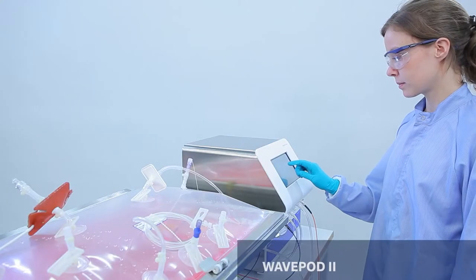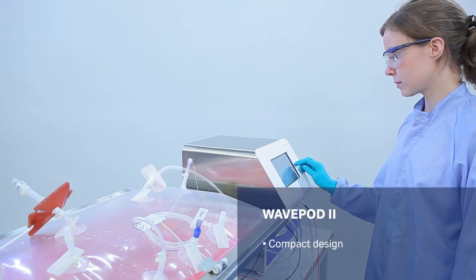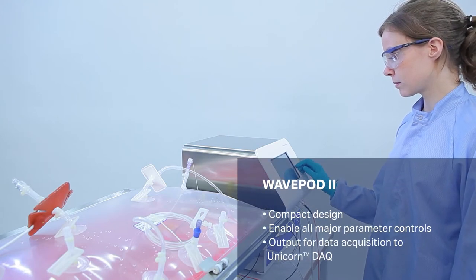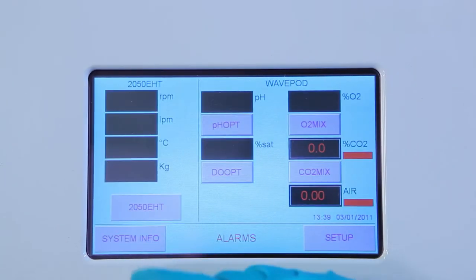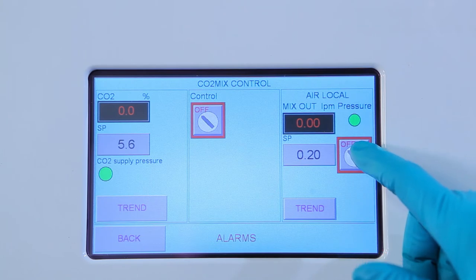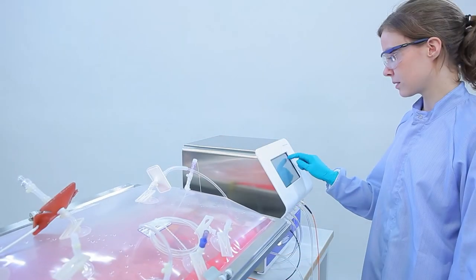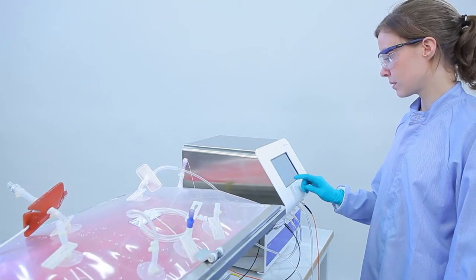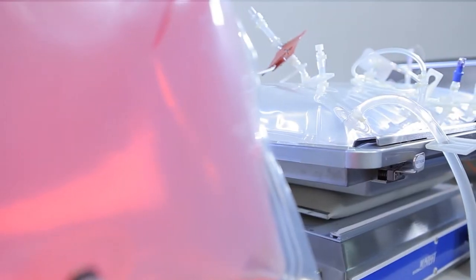The WavePod 2 integrated controller handles setup, control, and monitoring of cell culture parameters. The color touch screen provides easy access to all operations, data, and alarm conditions from the connected control modules. Start rocking, set angle and air parameters, and start the control of temperature and pH.